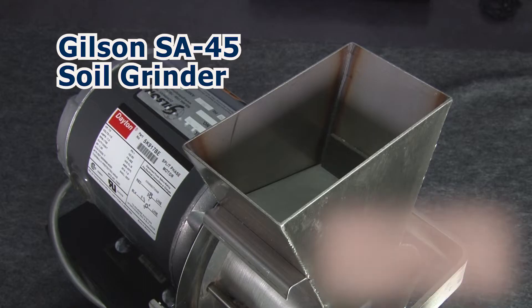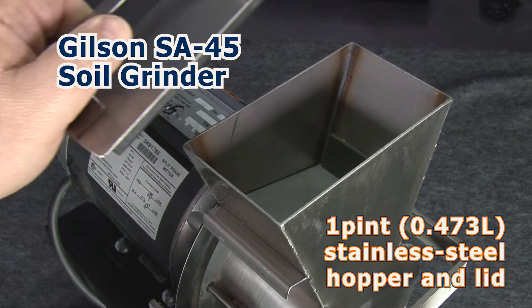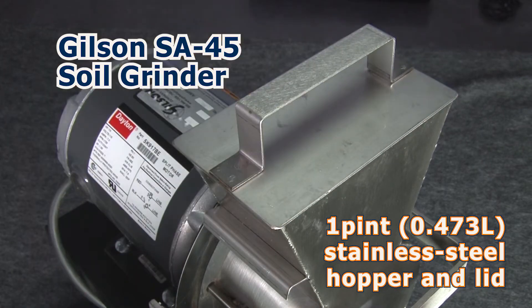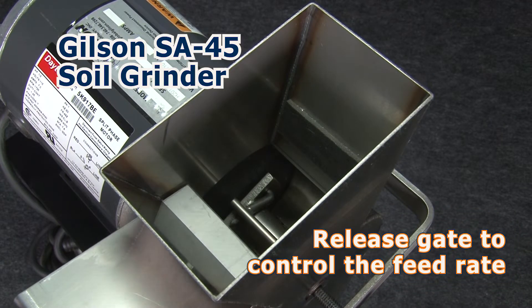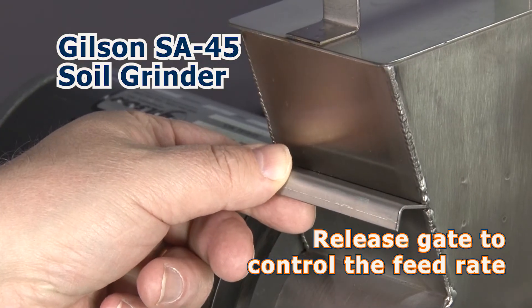The SA45 Grinder has a one-pint capacity stainless steel hopper and lid, and features a manually operated gate to control the feed rate to the stainless steel grinding chamber.